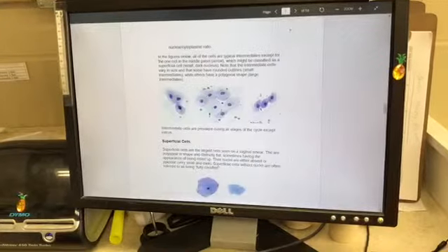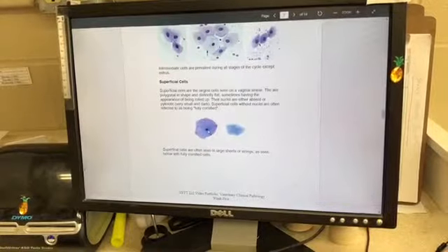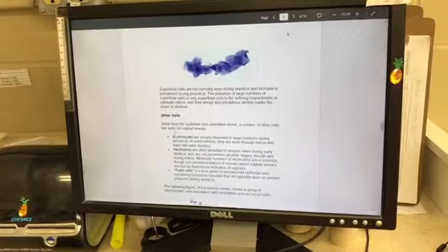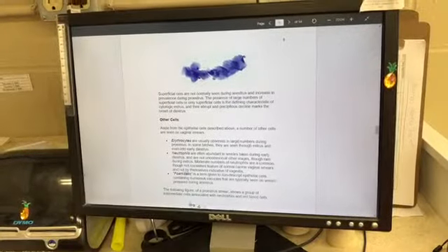Intermediate cells are going to look like this. And then the superficial cells, which I did see a few of as well. You'll also see other cells such as erythrocytes, neutrophils, and foam cells.